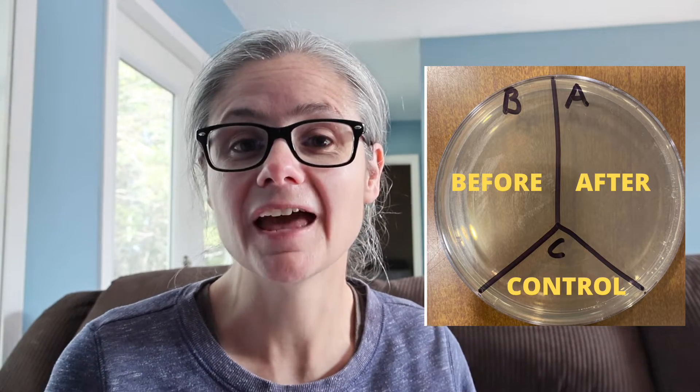In order to test how well Odoban actually removes bacteria, I'm going to take a petri dish like this one and label it A, B, and C. Then I'm going to take some sterile swabs and swab my floor. I'll place that sample in the section labeled B for before. Then I'm going to mop according to the Odoban directions. After it's dry, I'll take another sterile swab, swab the area again, and place that in the section labeled A for after. C is my control — nothing's going to go there.